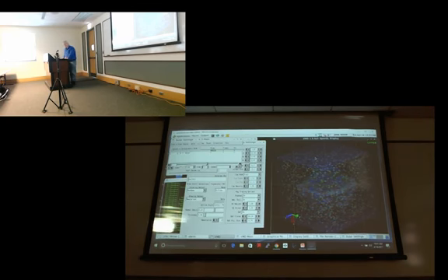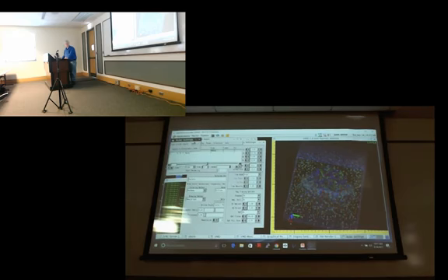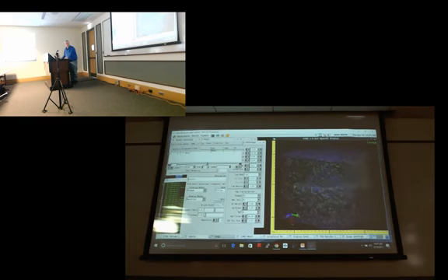Most of the time, when you are trying to look at the structure as a whole, the orthographic view is better, even to see some movements of your structure, because you see, I would say, without all the artifacts of a perspective, where all your structure is being distorted because of the view. And even to make some publication image, I would say orthographic is better, not only because your ions don't look like eggs as well. Yeah. So they look like spheres.